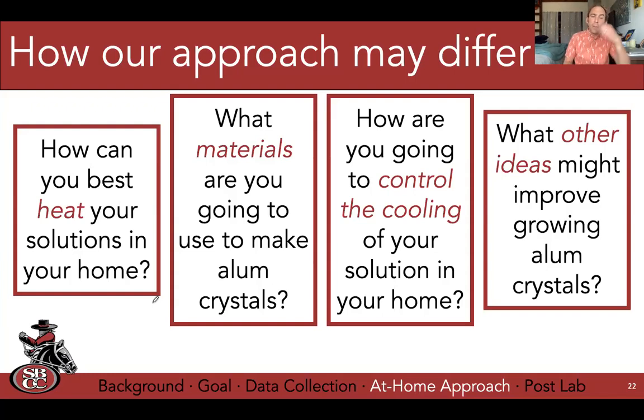So yeah, I'm not saying that the hot water bath won't work, but you're going to want to make sure that you're keeping the bottom water hot and you're staying safe. So it's just a little bit trickier.